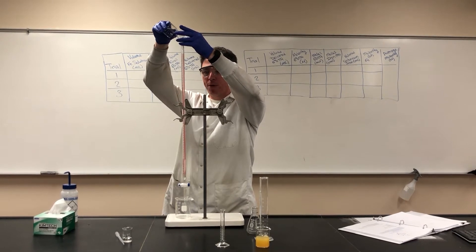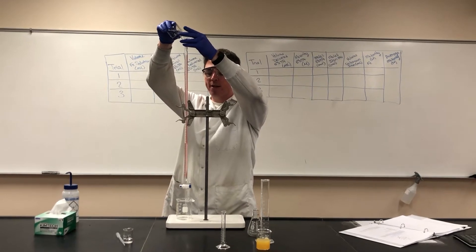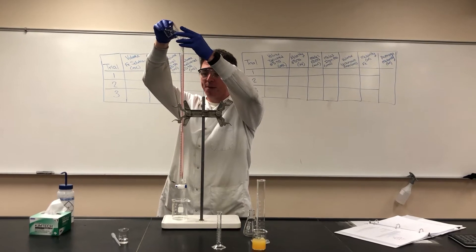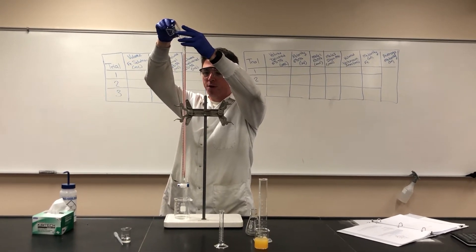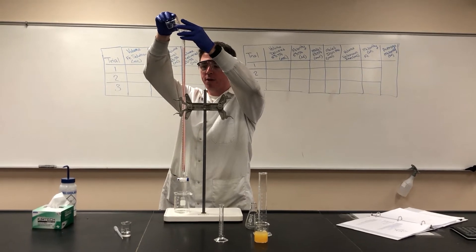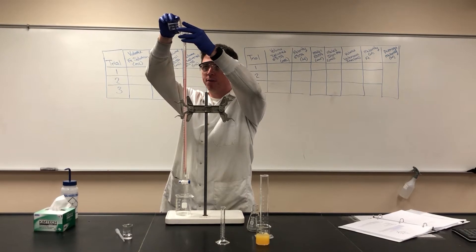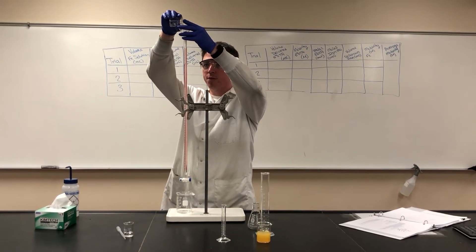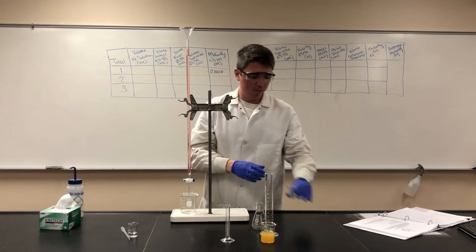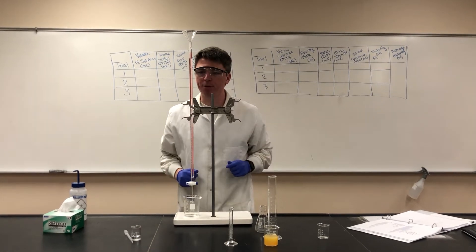Something to remember about burettes is they are numbered opposite of the way you would normally expect. Zero is up at the top and 50 is down towards the bottom. We'll fill this up roughly to the zero mark — if we go a little over it's not a big deal. We're a little under, and again that's fine as long as we have enough titrant to run our titration.